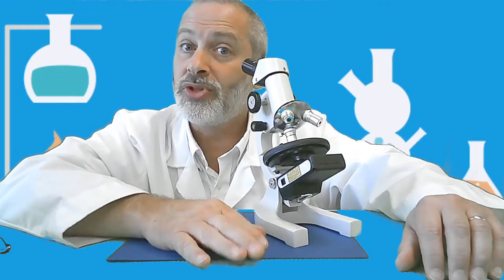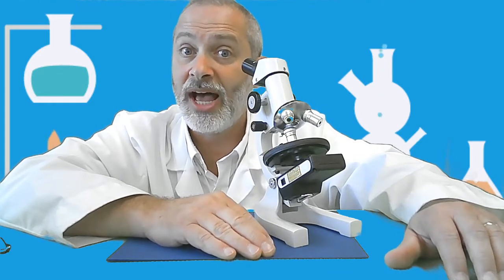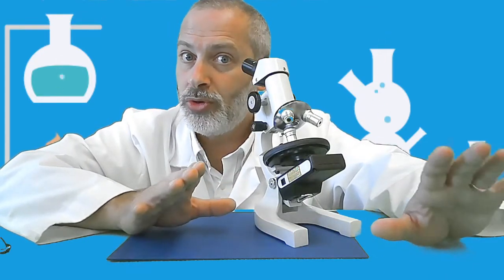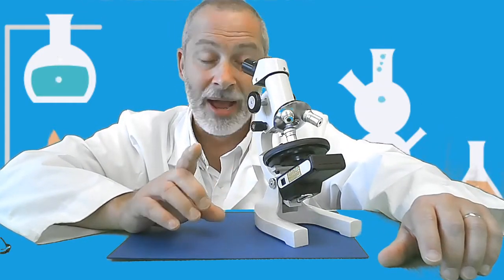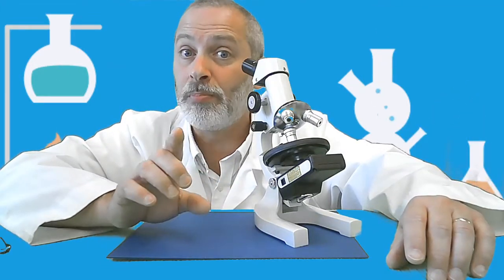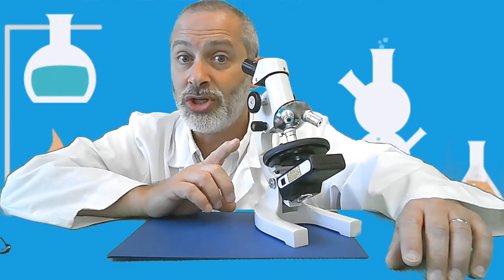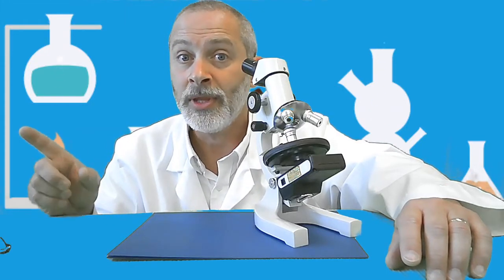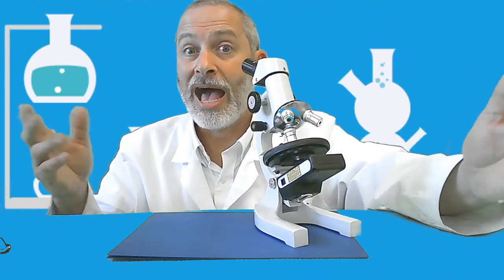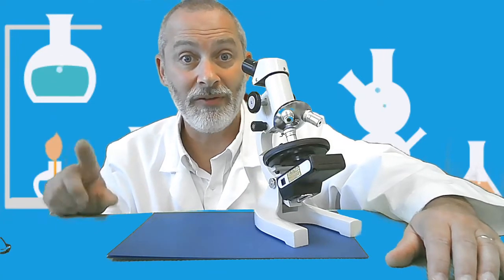So I've taken you through the steps of how to view a slide, a specimen on the slide, how to use the microscope, and I hope you remember those steps. I'm now going to take you through the steps of how to shut down the microscope before I show you the images. I took pictures of these images that I'm going to share with you in a moment so that you can complete your lab activity. So, how do we pack things up at the end of our activity?